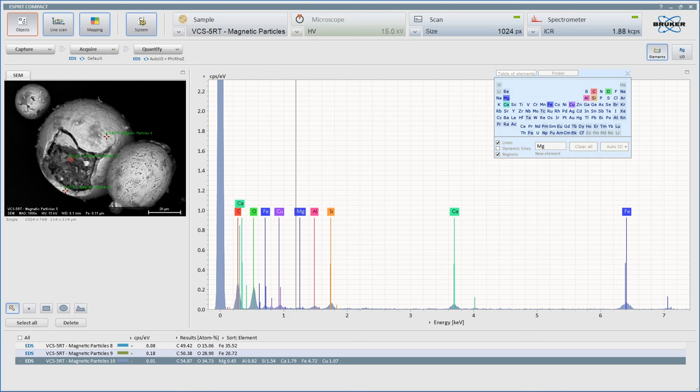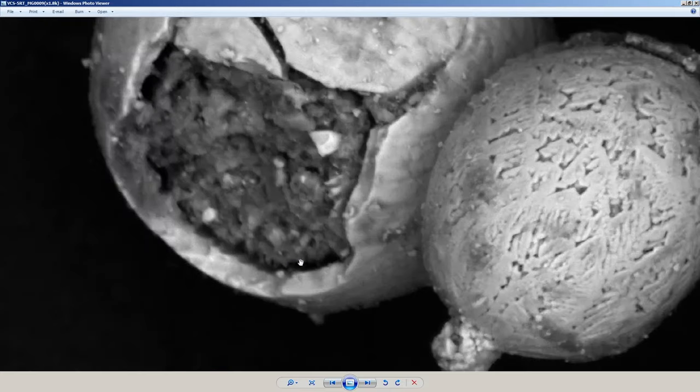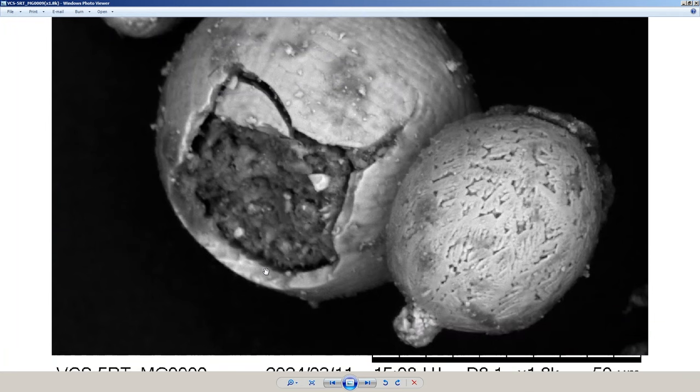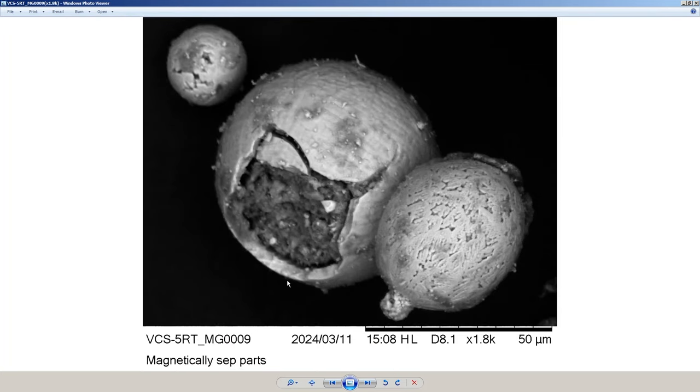If we go and look at the image here, and how should we open with this? You can see that actually this is separated here from this inside area. So you can imagine if this whole thing blew up, you would have a section of the shell like we saw with Alan's, and the guts had fallen out. Isn't nature a marvelous thing?